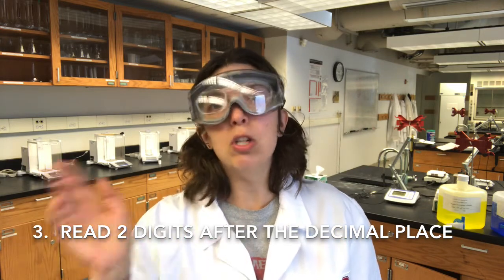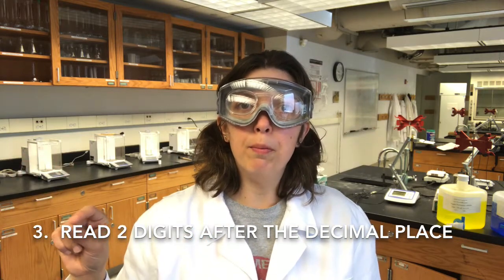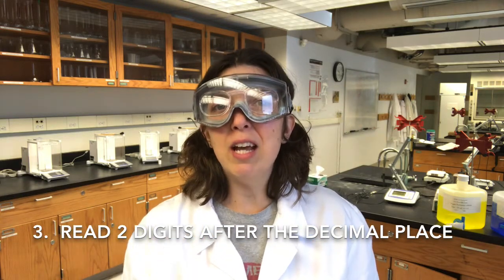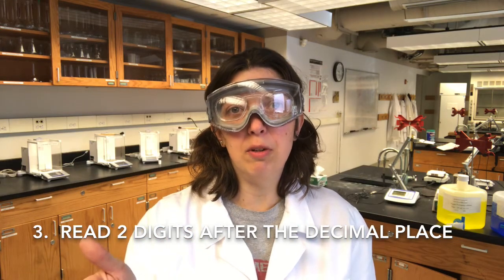So you need, for instance, 0.12. Each line that marks the 0.1 milliliter has a thickness of about 0.02 milliliters. So you can use that as an estimate for figuring out that last decimal place in your burette reading.